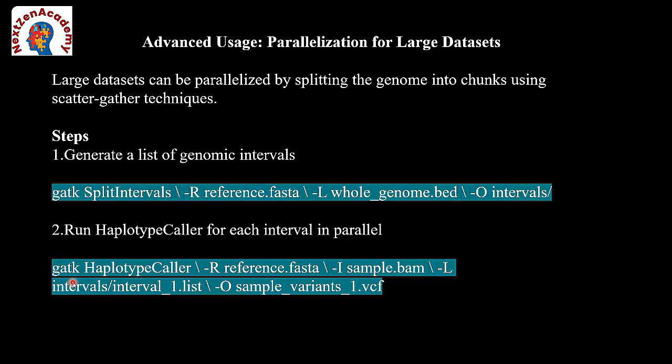If you are running with a single data set, you can run it like this. Capital R is the path to the reference genome.